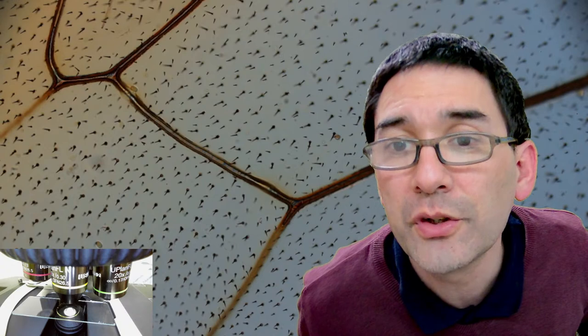I think it must be either the front or the back wing. Okay. So again, a couple of questions. Any recommendations for mounting fungi and spores? Would you think it would be similar to other plants? I think fungi and spores maybe less so, but actually fungi as such, you have to really cut them thin. And I think they're kind of sensitive as well to shrinkage. Would you think that is similar to other plant leaf mount procedures? I think it could be similar because fungi also have rigid cell walls. They're made of a different material, of chitin and not of cellulose. Because they have a cell wall, I think maybe the cells are a little bit more stable.